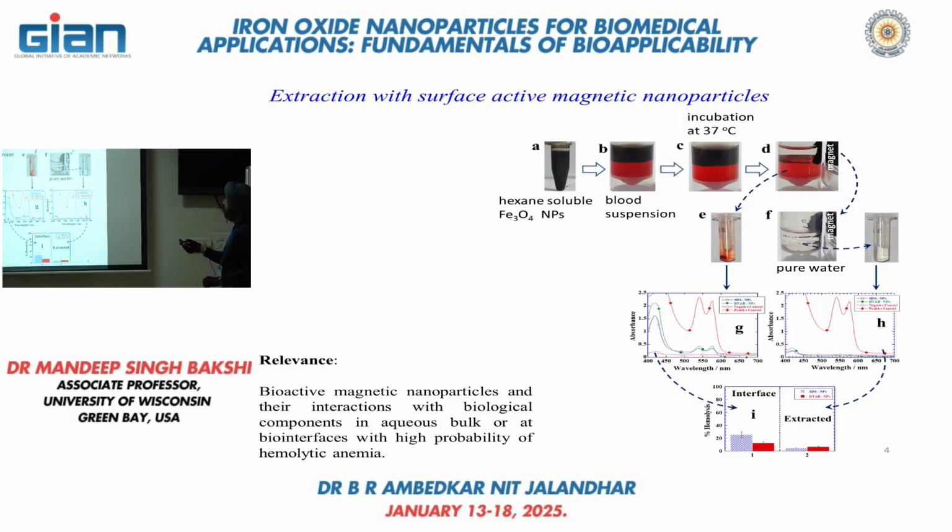The second one over here has the same concentration of the hemoglobin as that over here. So you can make out that there is no extraction. So we can figure out by performing all these steps whether extraction has taken place or not.